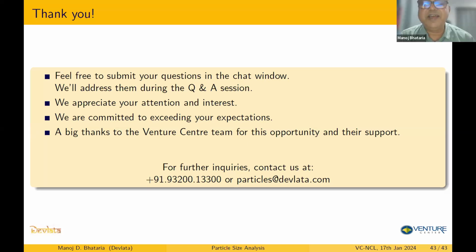Yes. See, as a default, you can go with 90 degrees. As I said, it will not have bias towards higher size or lower size. But as you gain more understanding of your samples and your sample preparation techniques also improve, that is, you don't have any unwanted particles in your sample, then you would like to compare the result with the other angles too. If your sample is clean, I mean, there are no higher size particles, then probably the other angles also will give reasonably good results. But if you're not sure, then typically you start with 90 degrees.